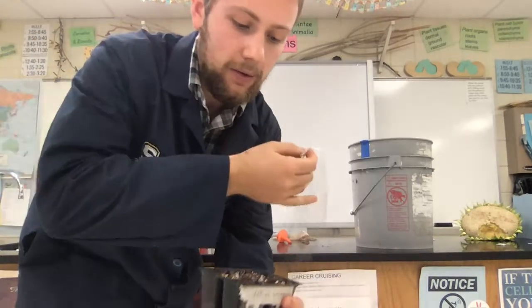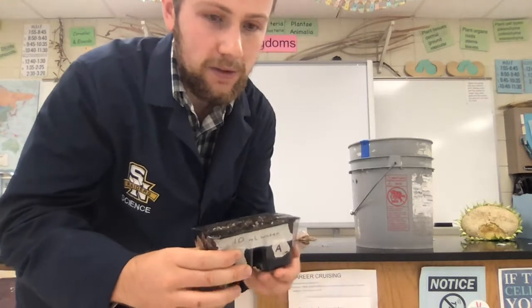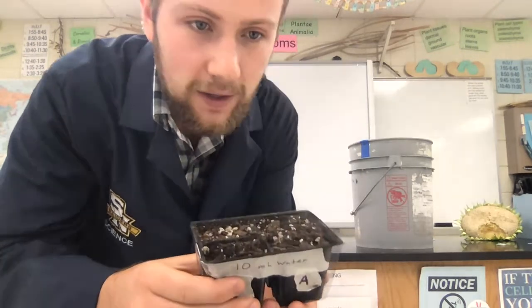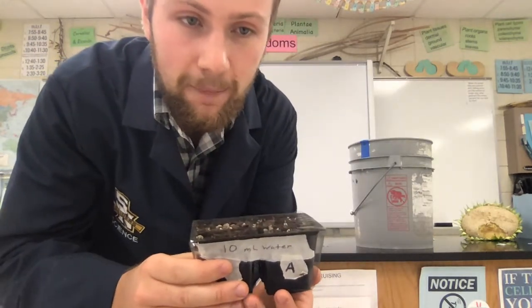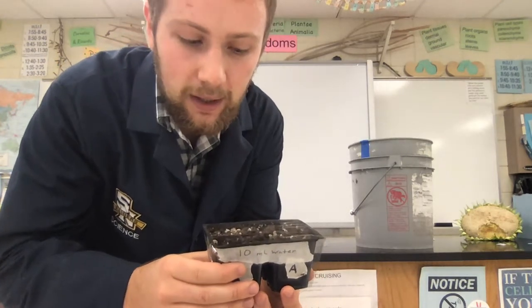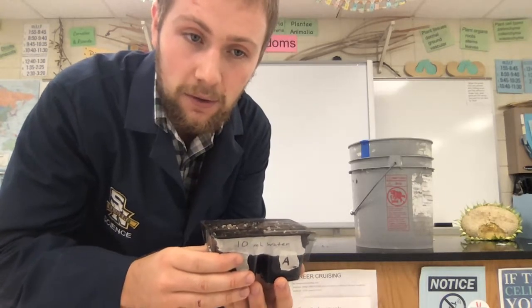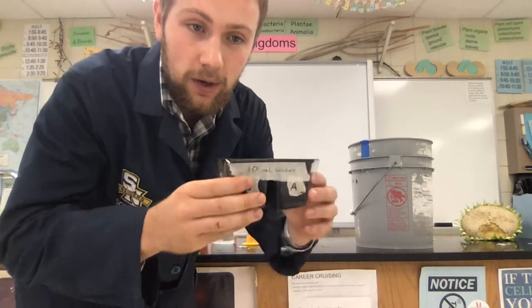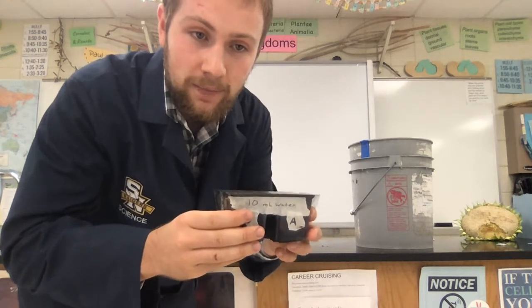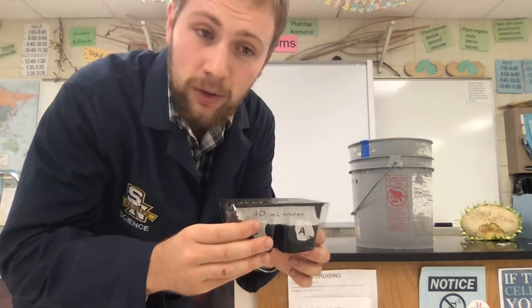We're just going to put it over the top. You could take a rubber band. We're just going to make it long enough so the container can sit right on it. So a piece of saran wrap over the top. Hopefully our seeds will germinate, and then we can remove the saran wrap once we see seedlings above the soil. But this will get placed in a kind of cool, dry, dark place, and then we will wait and see what happens.